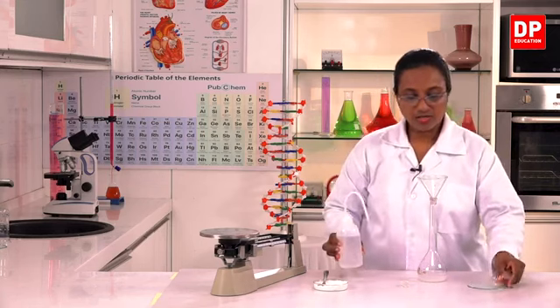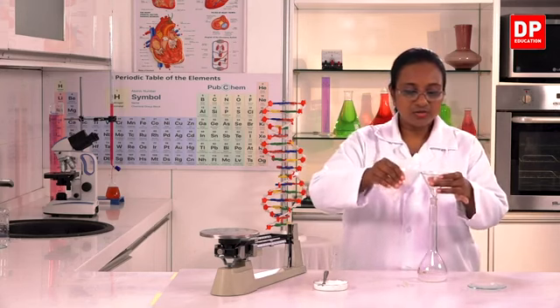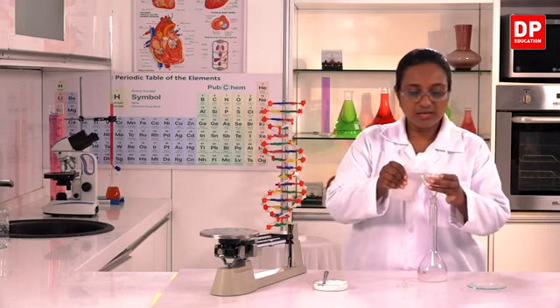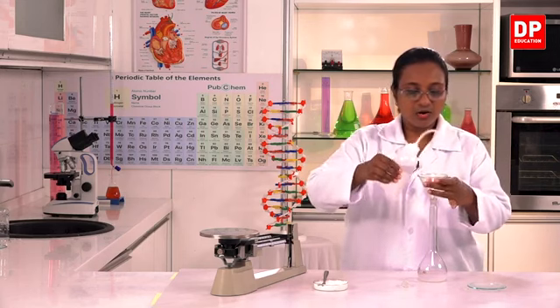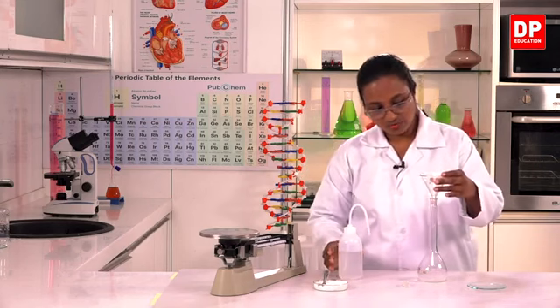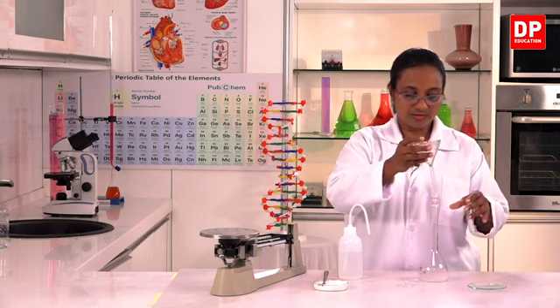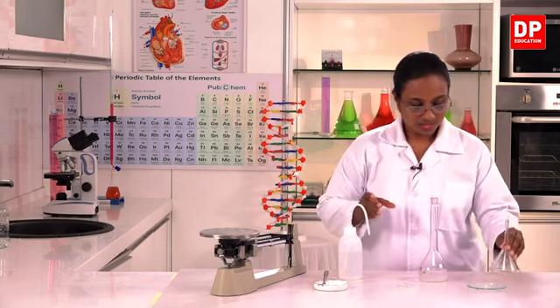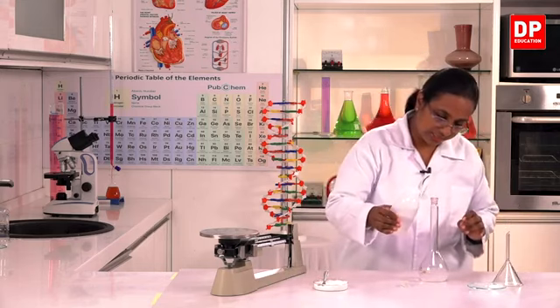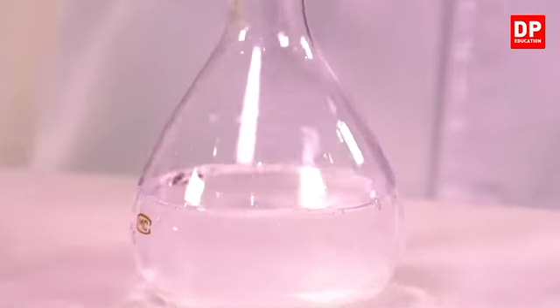Now I have transferred all the solute into the volumetric flask, and also I wash the funnel again to make sure that all the solute is transferred into the volumetric flask. Now what I have to do is add about 3/4 of the volume of water.